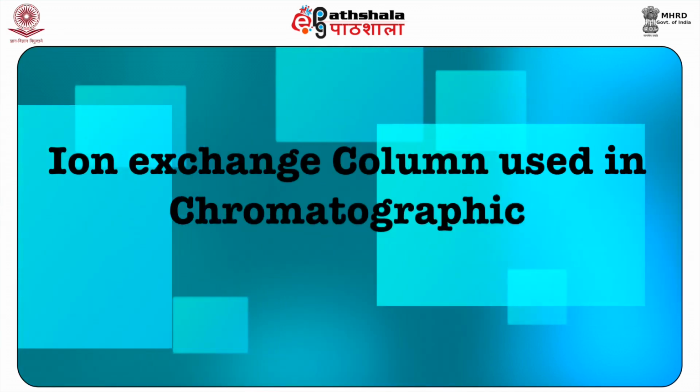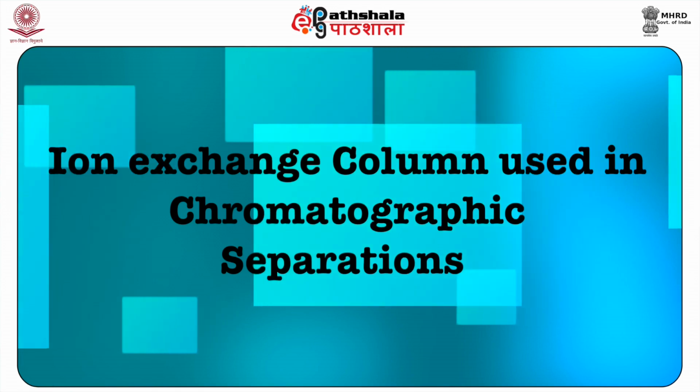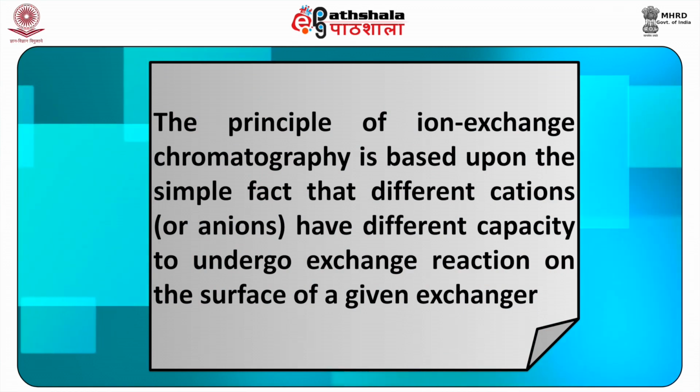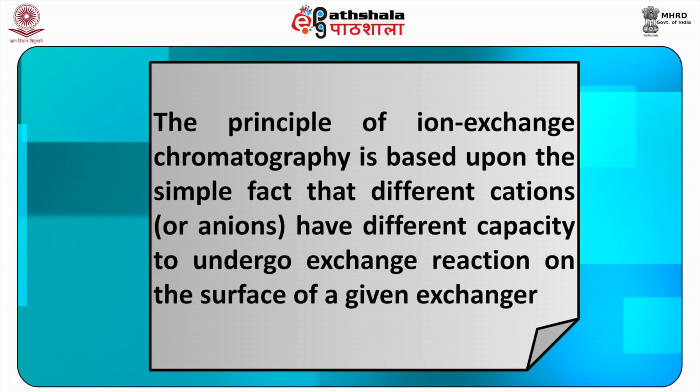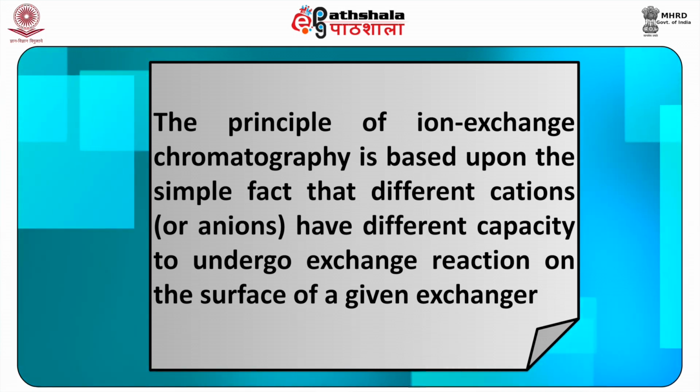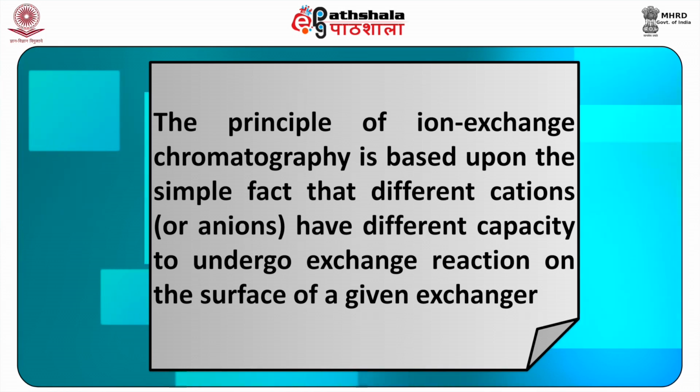Ion exchange column used in the chromatographic separations. The principle of ion exchange chromatography is based upon the simple fact that the different cations or anions have different capacity to undergo exchange reaction on the surface of a given exchanger.